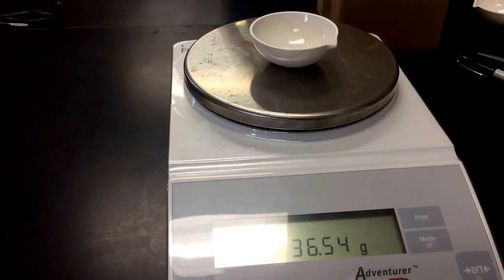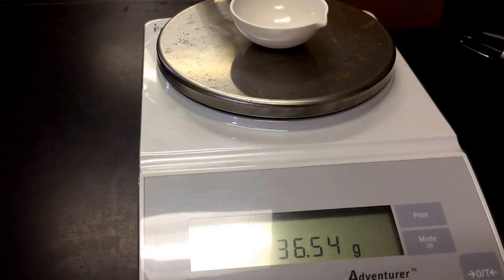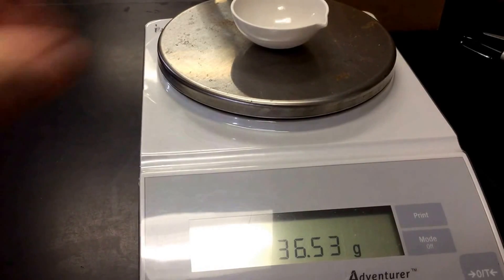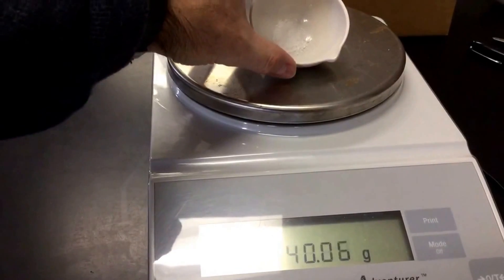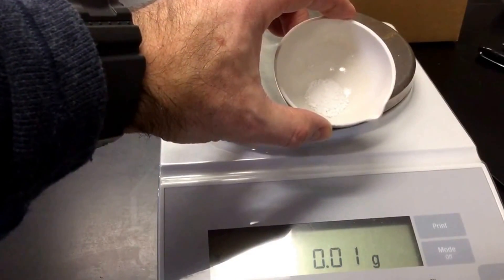I think that's good enough for us. So then in our data table, we would record 36.54 and write that down. And that's going to be what we need to do as far as weighing out our chemical. And you can see, it's not very much in our dish, but that's all we're going to need to do our lab.